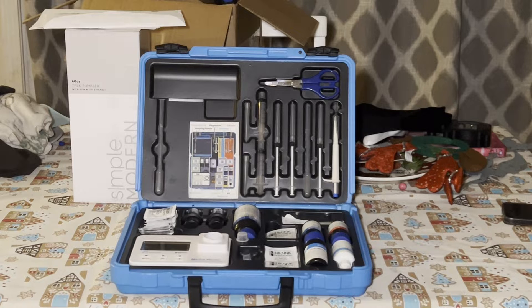What's up guys? This is my review of the Hanna Marine multi-parameter photometer. Inside this kit, Hanna literally gives you everything that you would need to get up and going to start testing your reef tank.